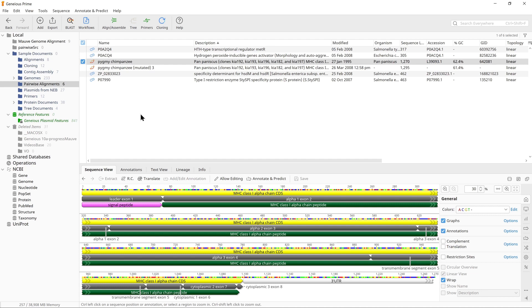In particular, repeated regions, inversions, and translocations can be viewed in a dot plot, but are not handled by pairwise alignment methods.